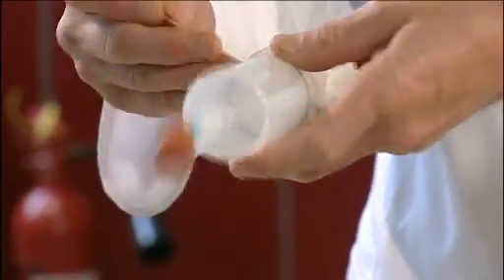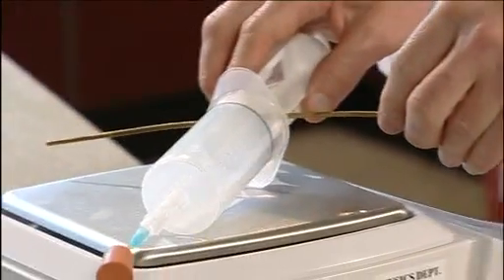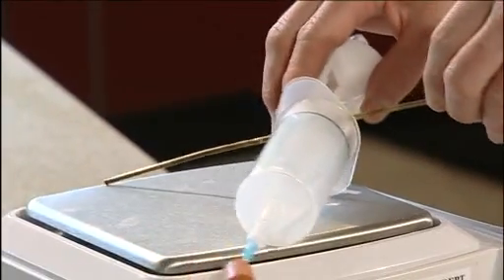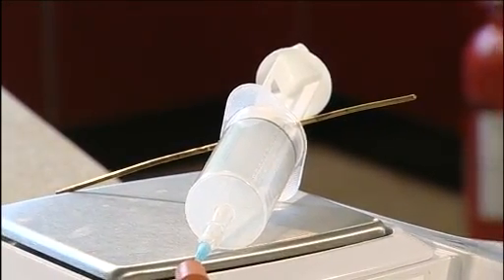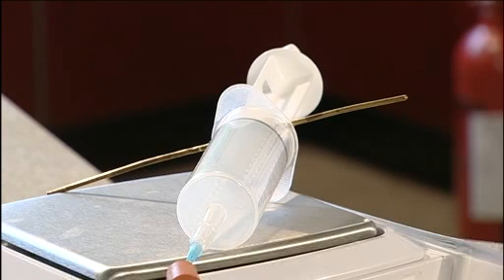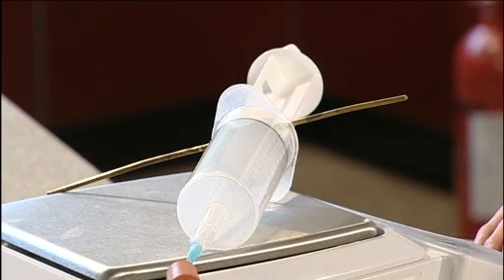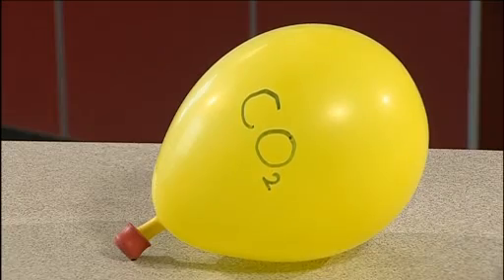with a rubber bung. We no longer need the rod, of course, to hold the plunger at 100 cubic centimeters, but we must be careful to reweigh the whole assembly on the top pan balance. We now have the weight of the syringe plus 100 cubic centimeters of carbon dioxide, and the difference, of course, is the weight of 100 cubic centimeters of carbon dioxide. Since we know that at room conditions a mole of any gas has a volume of 24,000 cubic centimeters, we can calculate the relative molecular mass of the gas simply by multiplying by 240.